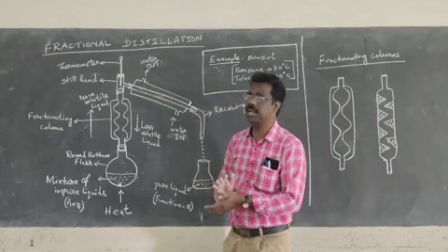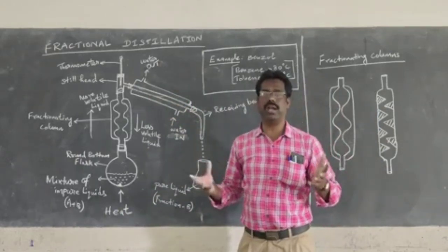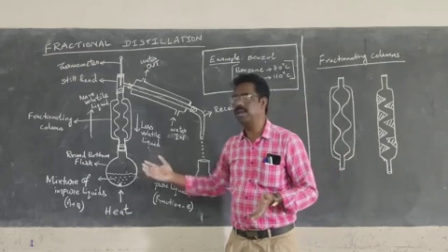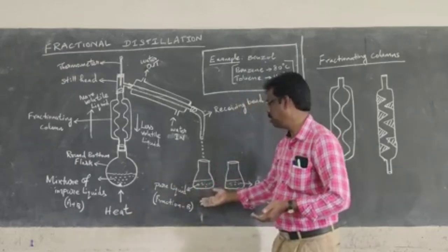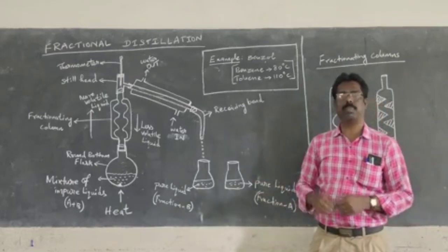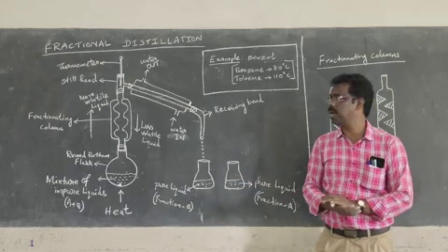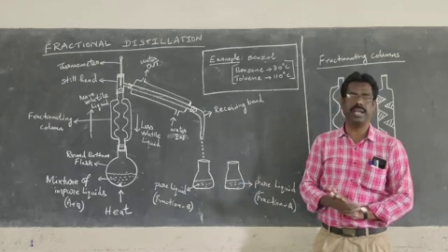So through this fractional distillation, we can purify more than one liquid from a mixture of liquids one by one, collect fraction A and fraction B separately, and separate the pure fractions from a mixture of liquids. Hope you can understand the fractional distillation technique. Thank you.